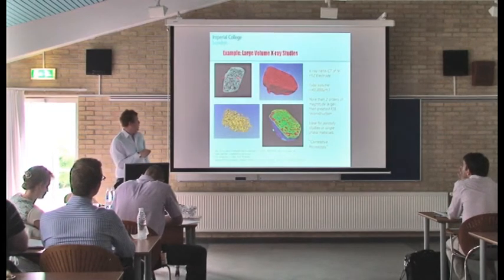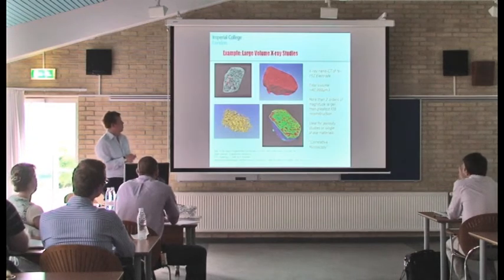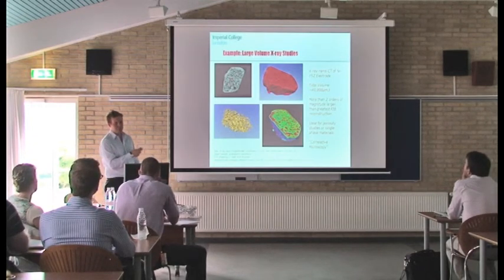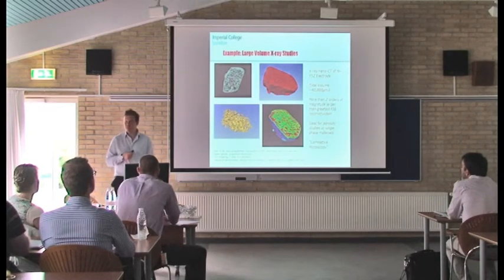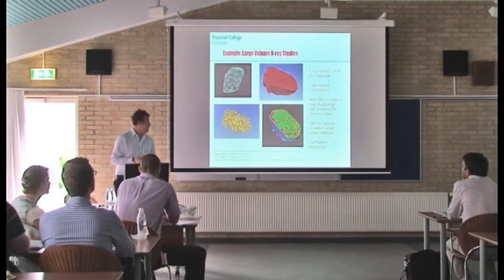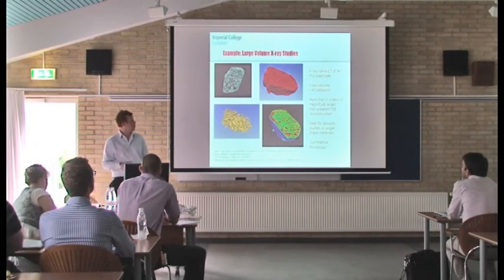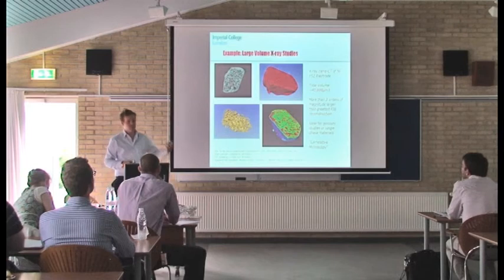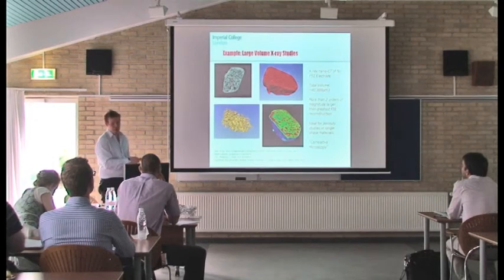However, you can see this is an individual slice from the tomography data set. You can see that whilst there is some phase contrast between the grains, it's also demonstrated in this 3D reconstruction here. You can see the grayscale contrast. It's not really sufficiently reliable from lab-based systems to be able to resolve the nickel zirconia contact and the triple phase boundary, which obviously we're all very interested in. However, it did indicate that maybe it is possible to isolate this triple phase contact using X-ray sources, but maybe not in a lab-based system. So all these studies were done in a lab-based system with a fixed X-ray energy.